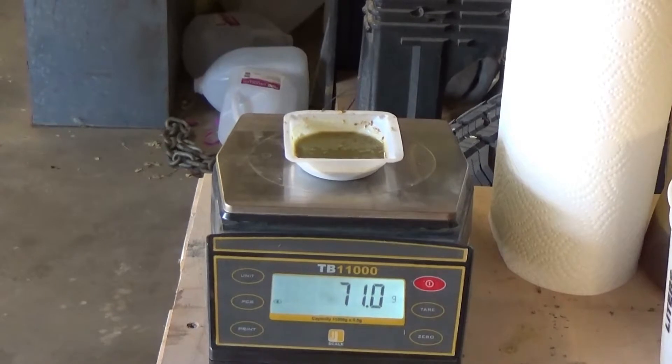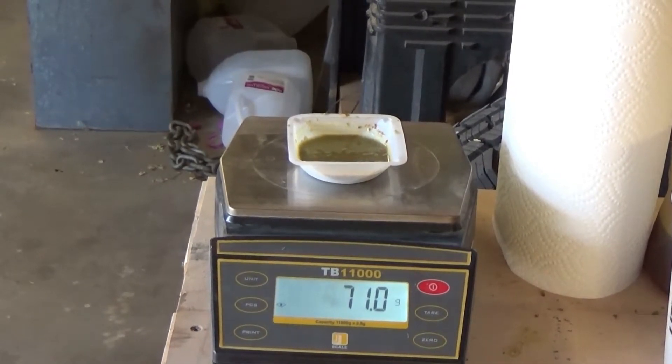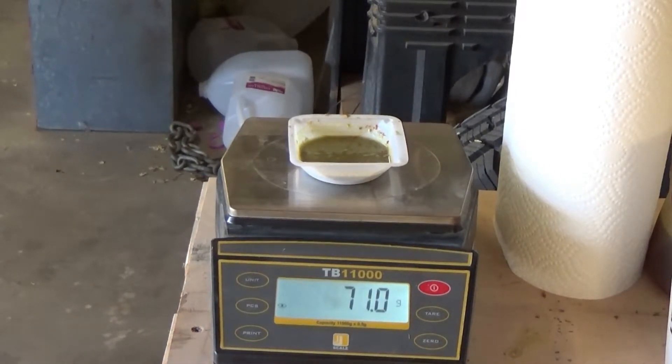This is the sponge from the so-called Telluride ore, and it's 71 grams. We're going to put it in the induction furnace and see what we come up with.